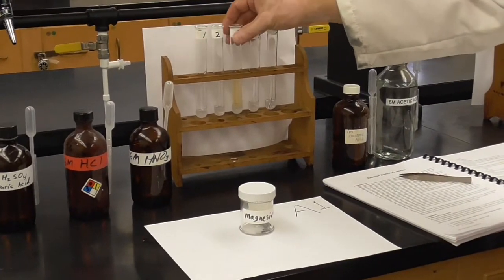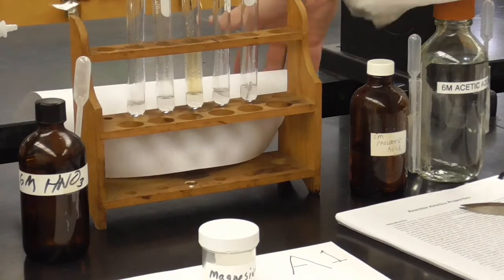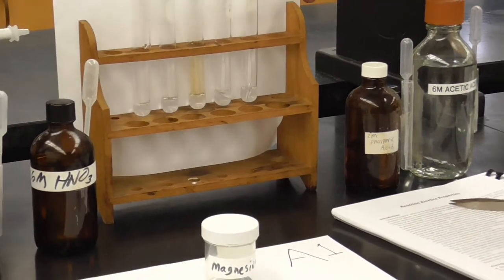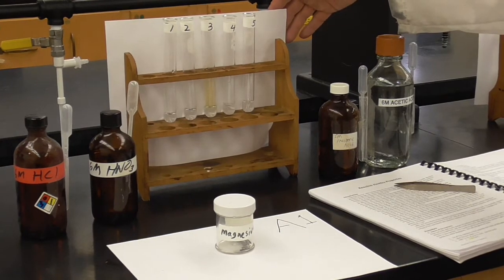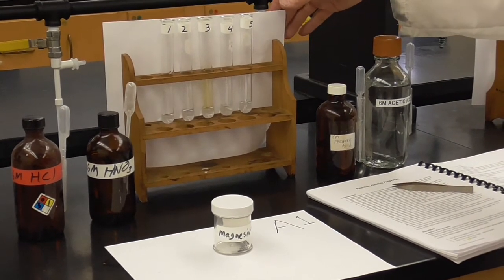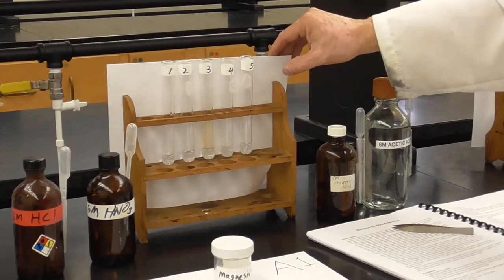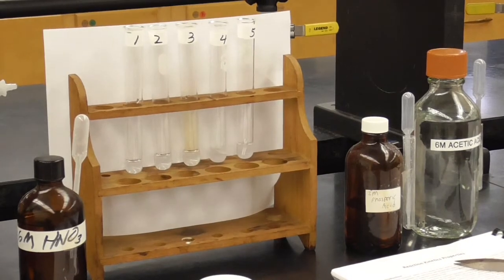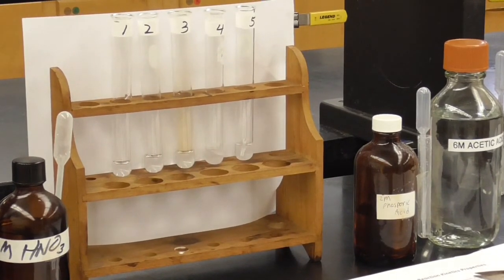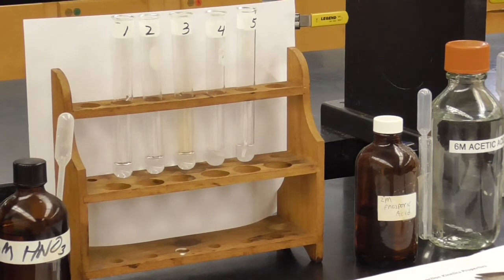Let's see, we've got some reactions definitely happening. Oops, my paper fell. Some of them reacted very quickly. Some of them are still reacting, aren't they? So we'll watch that for a while. And you'll want to note which one was the fastest, which one was the slowest. Of course, the beauty of video is you can back it up and watch it again.